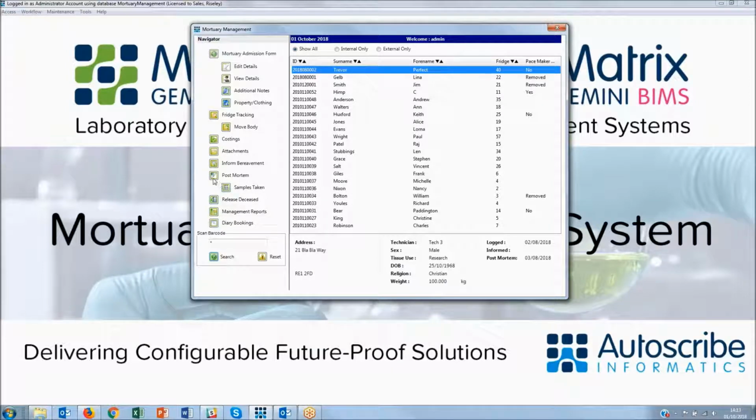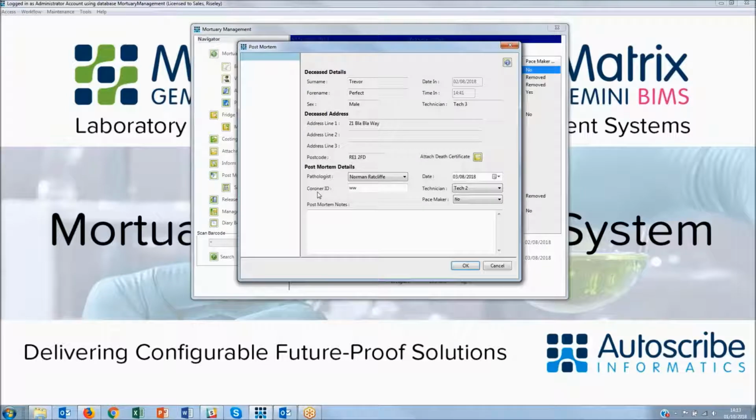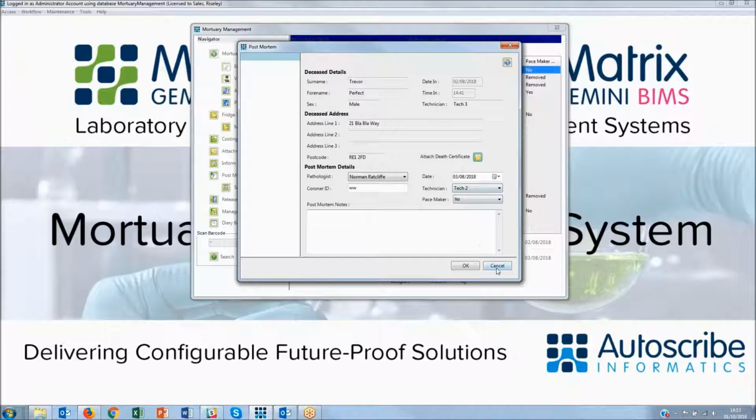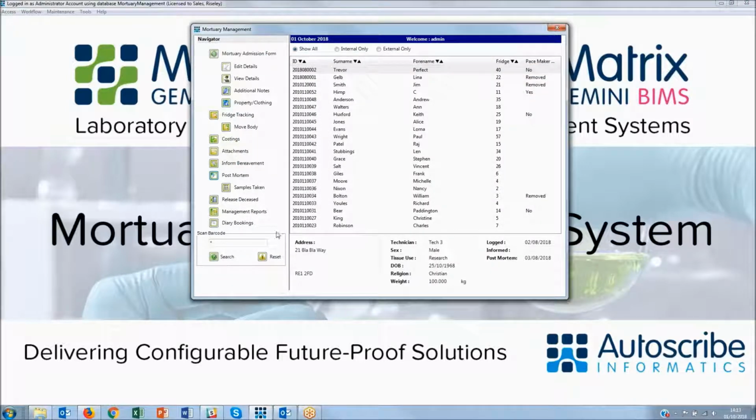Okay, so you will probably have some post-mortem information to add in. This is the post-mortem screen, and here we'll be adding information about the post-mortem, the pathologist, maybe the coroner, ID number, the technician helping out, whether they have a pacemaker fitted, etc. And again, here there's another chance to add a death certificate against the patient. And here's some free-fill text that you can add in as well.